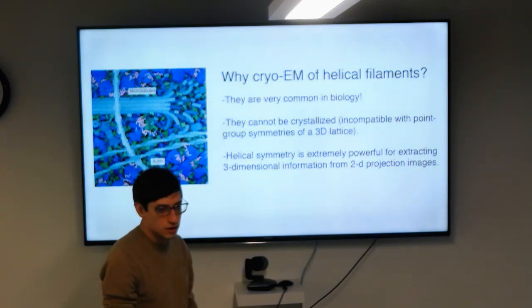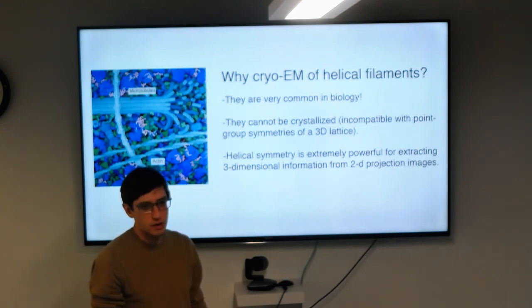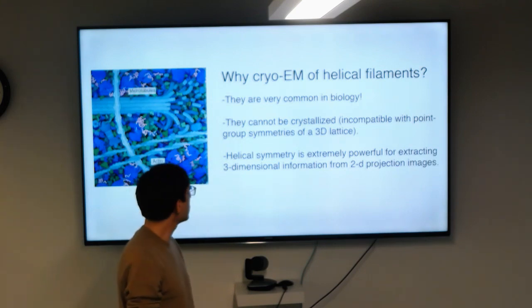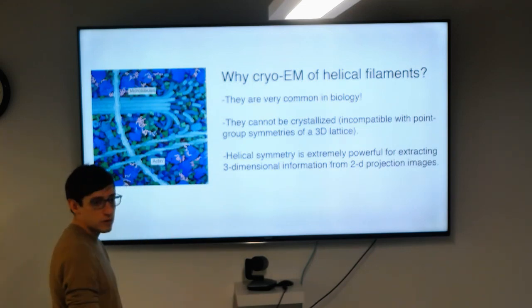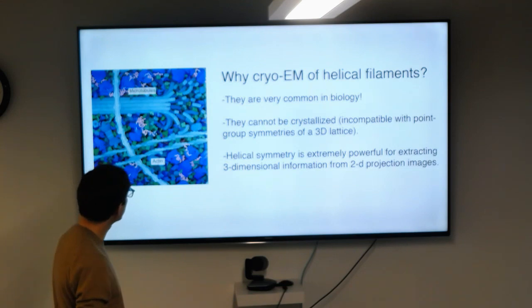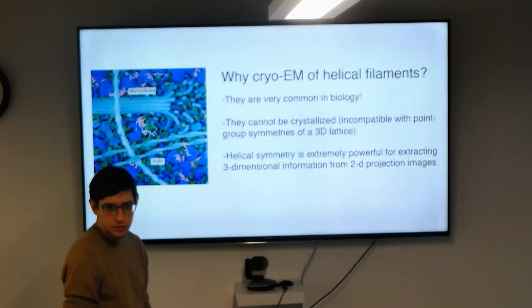Before we get into that, why would you even do helical cryo-EM on helical filaments? As Ed mentioned, they're really common in biology, so I just highlighted a couple examples here of cytoskeletal filaments that are found in the cell, in all cells actually, bacterial cells, eukaryotic cells. And I've actually focused on these two particular categories of cytoskeletal filaments in my career. So these actually have a really long historical importance in EM.